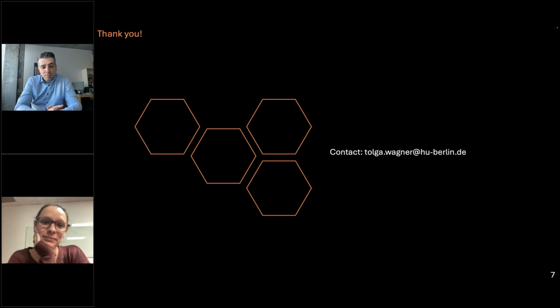This is the spatial resolution, but it changes instantly if you use a different detector. So holography is capable of doing atomically resolved investigations. There are a lot of publications about it, even from Michael Lehmann. And the phase sensitivity, this is something that needs to be discussed a lot longer, and is not to be cleared here.